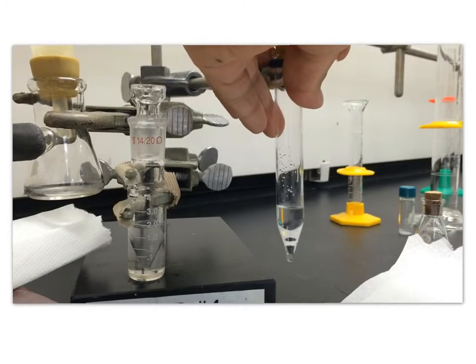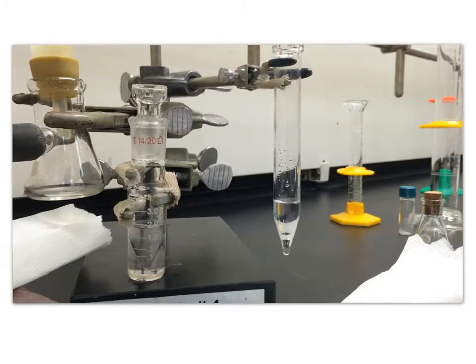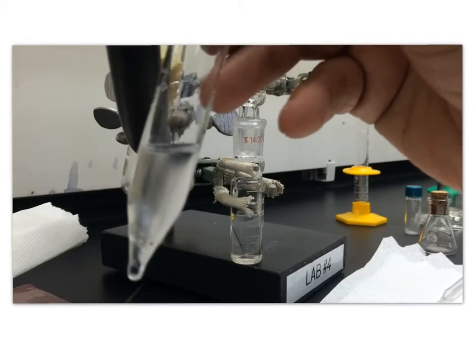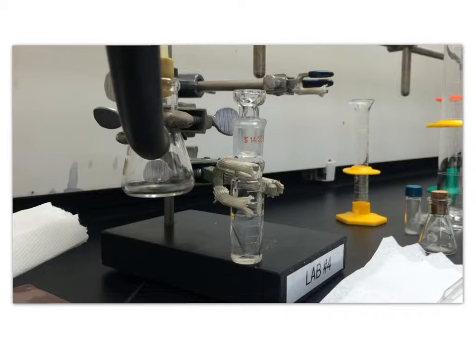But now that it was transferred to an aqueous solution and mixed with NaOH, the extra hydrogen ion is removed and it goes back to its original state. Hence, since it was now in an aqueous solution, it would show its presence as a precipitate because it's not soluble in an aqueous solution.